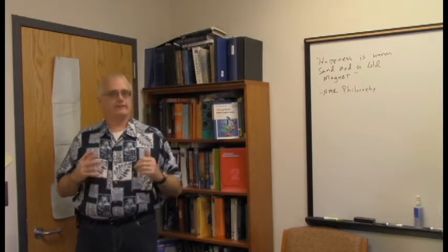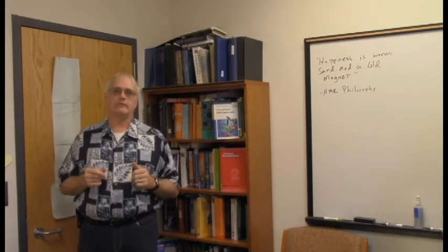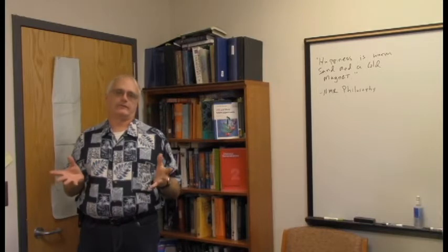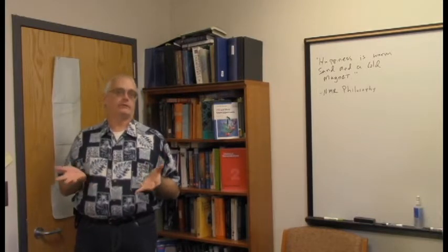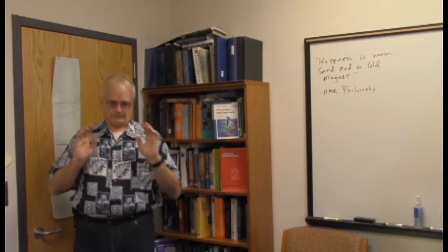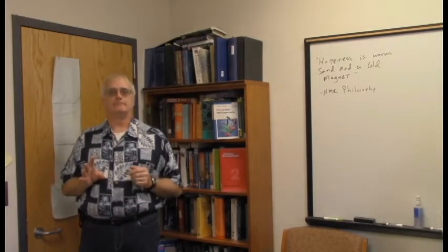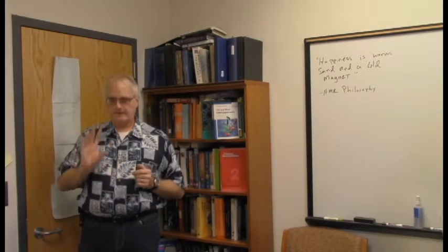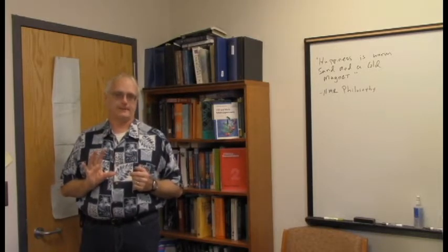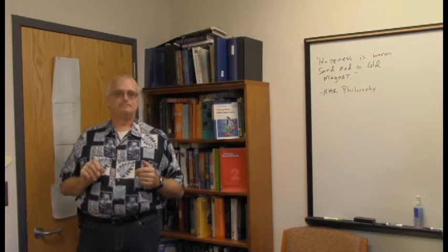I'll give you an example that I was using in my class. I told the class that the spectrum I gave them was an over-the-counter pain medication. Well, which one was it? And we'll run through all that in just a moment. But here are your 5 regions. These are the 5 that you really need to look at carefully. Okay? So here they go.